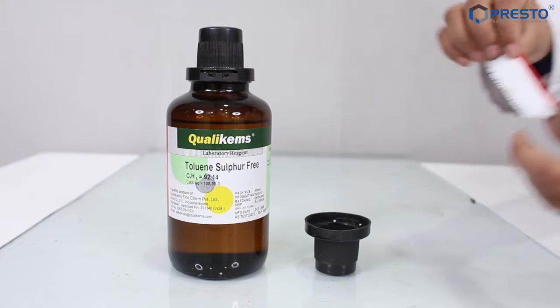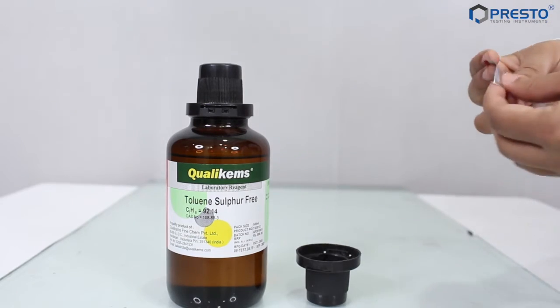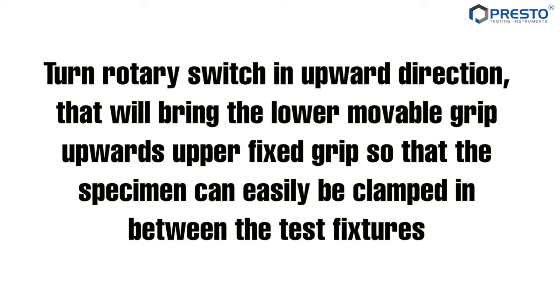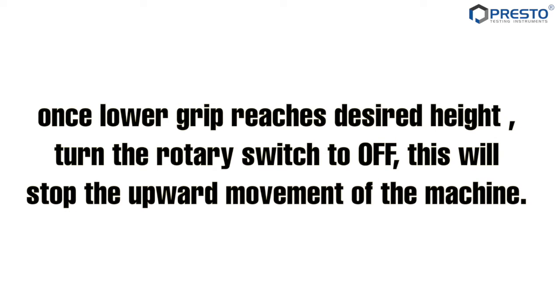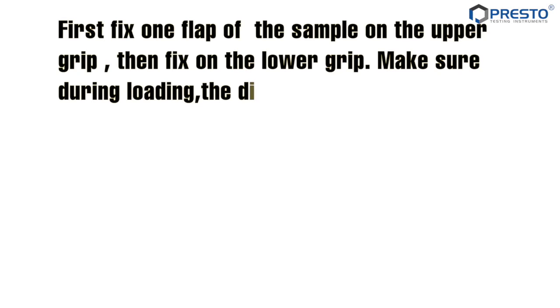Turn the rotary switch in the upward direction. That will bring the lower moveable grip upwards toward the upper fixed grip, so that the specimen can easily be clamped in between the test fixtures. Once the lower grip reaches the desired height, turn the rotary switch to off. This will stop the upward movement of the machine. Ensure that the lower limit switch ring is placed at a position that keeps a minimum distance of 25 millimetres.